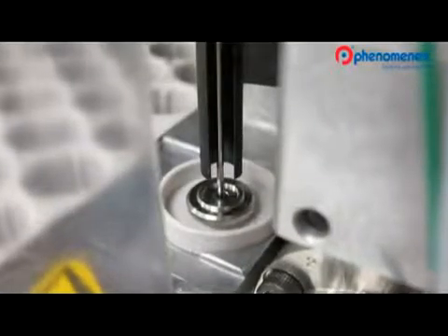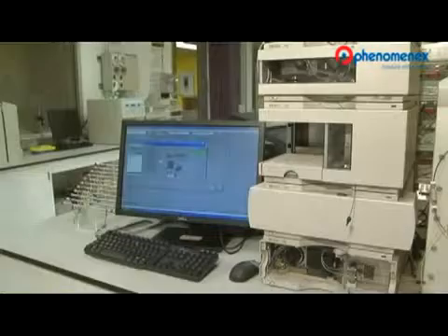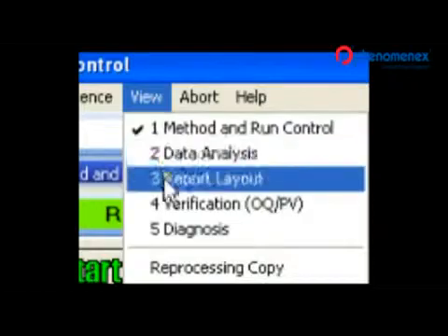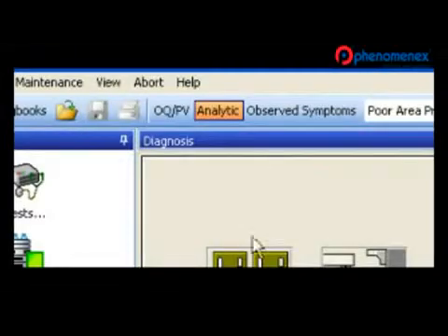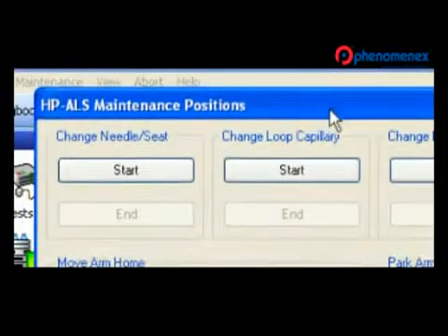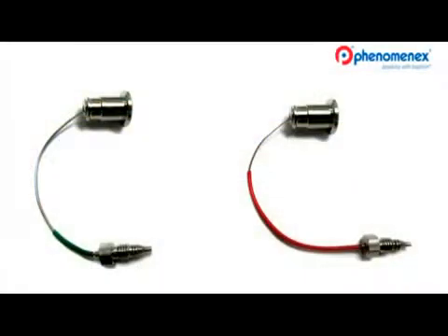The next thing you want to do to further reduce extra column band broadening is to change the needle seat. You will need to go into the software to perform this. Going to the diagnosis window of the software, navigate to the high-performance ALS window, select maintenance positions, then hit the start button in the sub-window titled 'Change Needle Seat.' This lifts the needle so that the seat can be replaced. I'll remove the current needle seat and replace it with a low volume part.